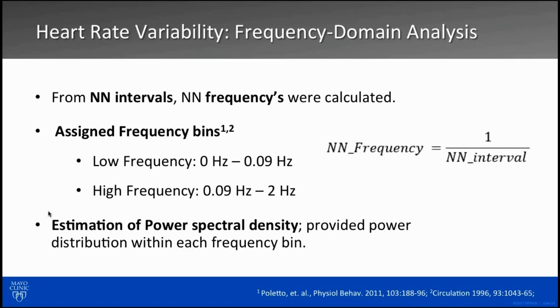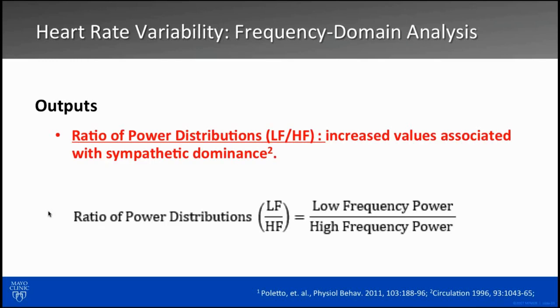We also wanted to look at the power distribution of the frequency analysis. So we calculated the power distribution ratio of the low frequency to the high frequency domain, mostly because increased values of this ratio are associated with sympathetic dominance. So you will see later on LF to HF ratios as part of our data.